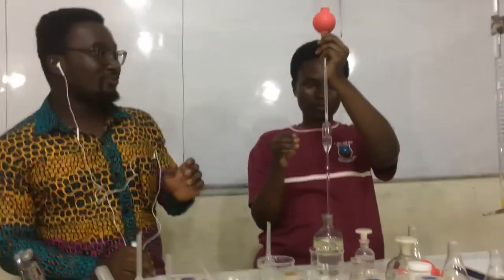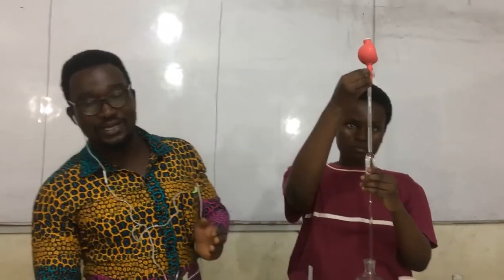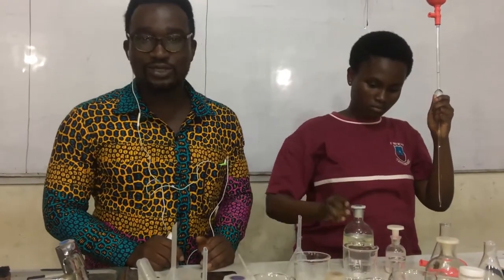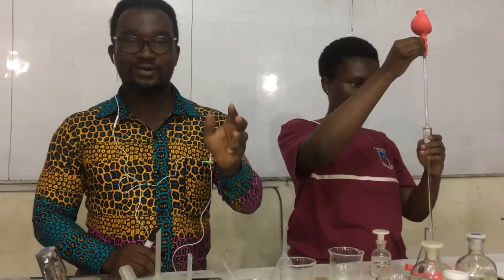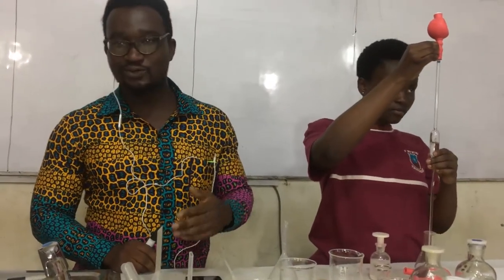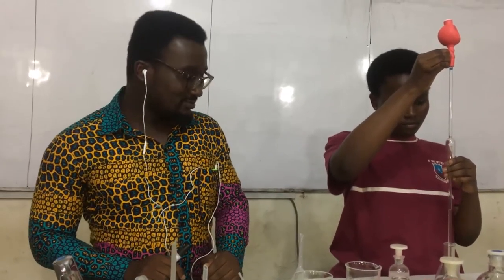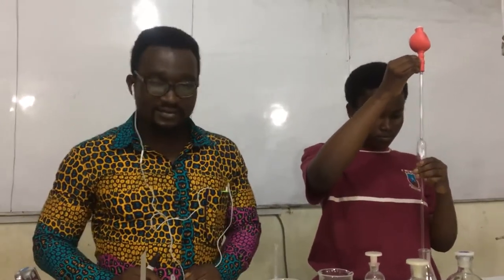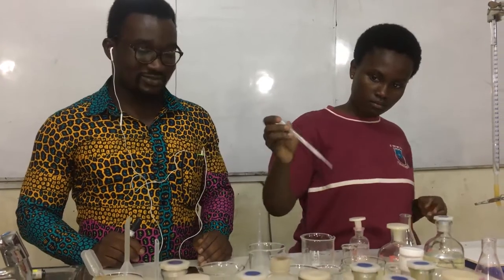In fact, don't be troubled with a pipette filler. You can use your mouth as we used to do in the olden days. This is only to help so that you don't drink portions of the solution before you complete school. Or if you are in your laboratory right now, so that you don't drink portions you are not supposed to drink. That is why there is a need for the pipette filler. So the rest of the schools, I recommend the pipette filler. If your school can buy the air pipette, it's okay, because it's much.